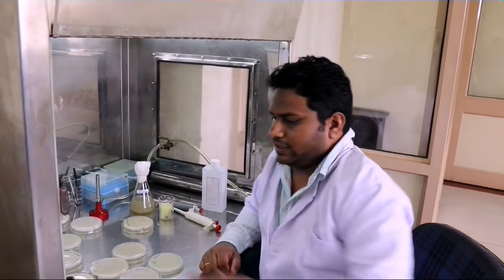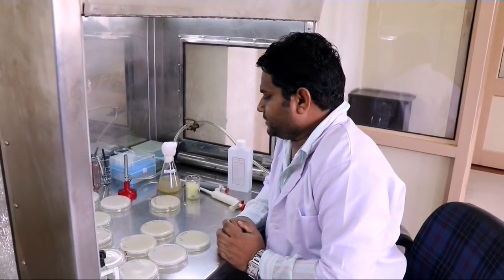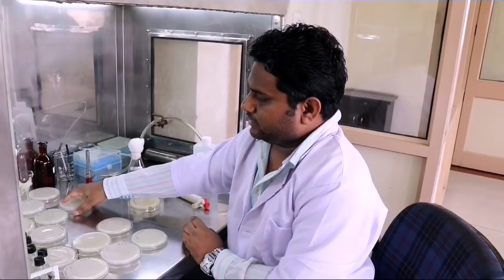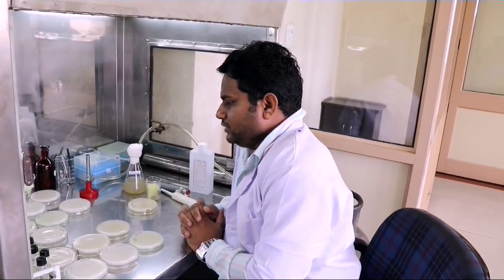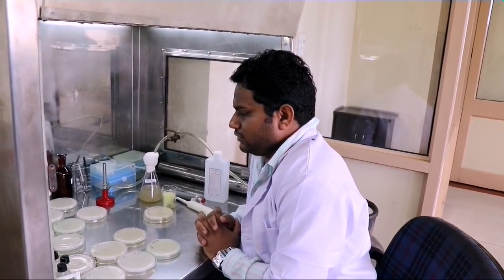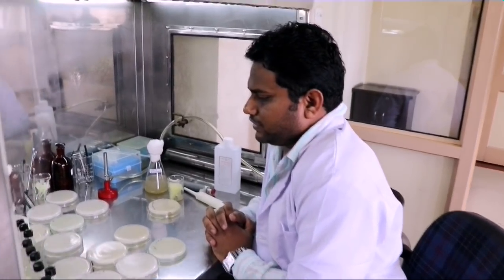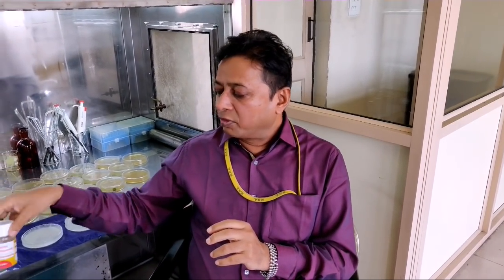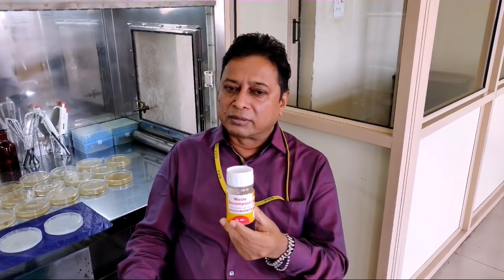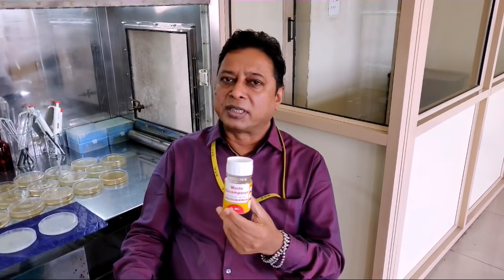We have inoculated the dilutions in the corresponding plates as well as the pure culture in its corresponding plate. Now we will incubate them in the incubator for 2 to 3 days and observe the colonies that are produced. As Dr. Praveen has tested the waste decomposer to know whether azotobacter bacteria — that is nitrogen-fixing bacteria — is present inside.